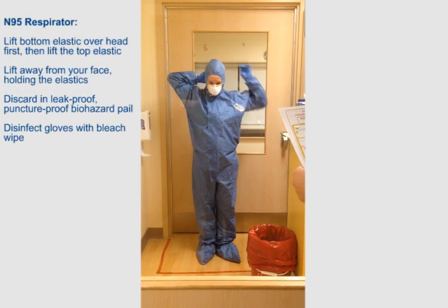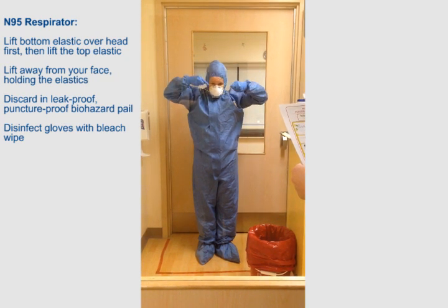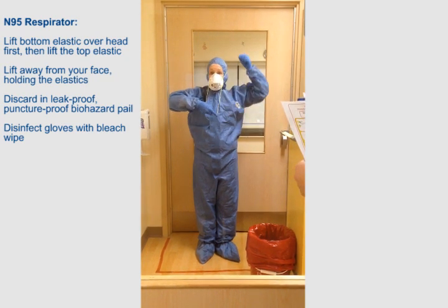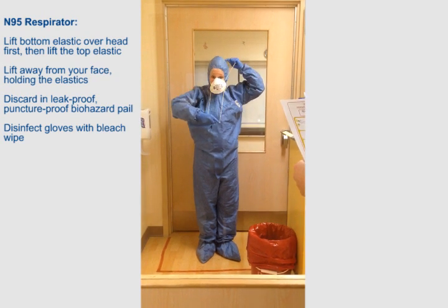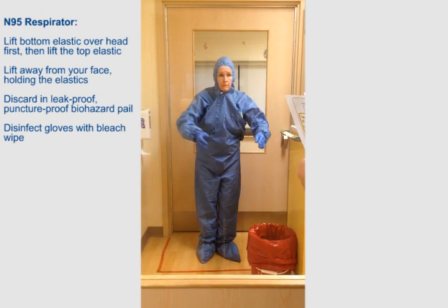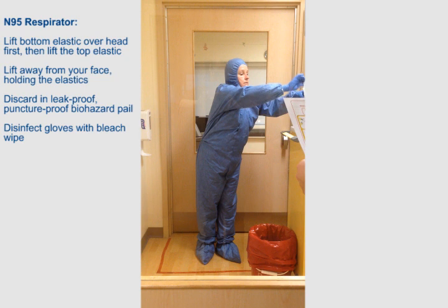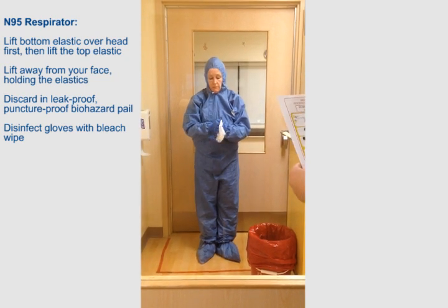N95 respirator. Lift bottom elastic overhead first, then lift the top elastic. Lift away from face, holding the elastics. Discard in leak-proof, puncture-proof biohazard pail. Disinfect gloves with bleach wipe.